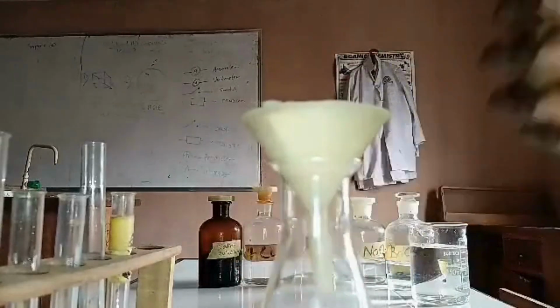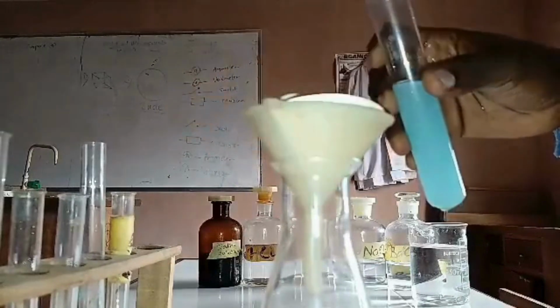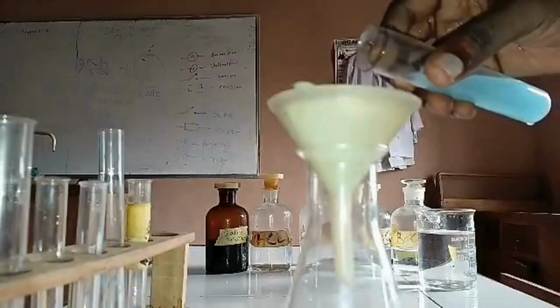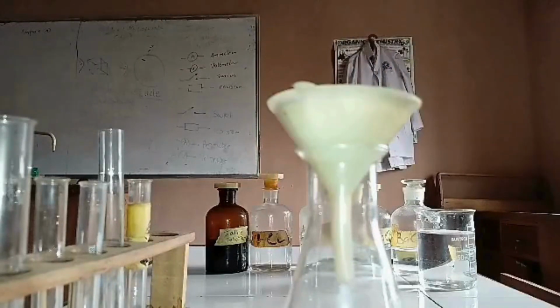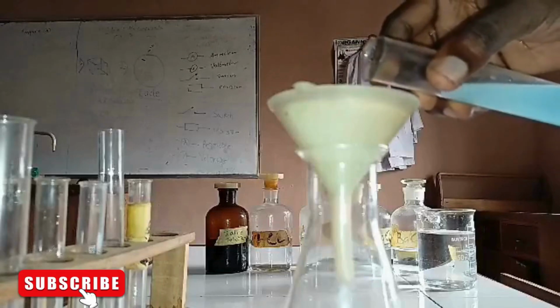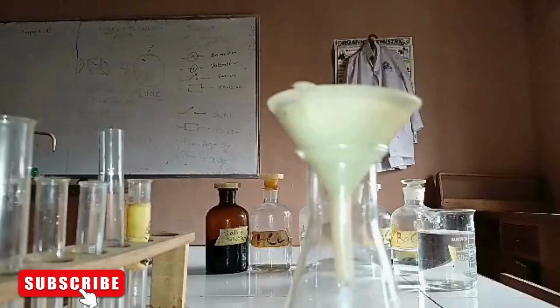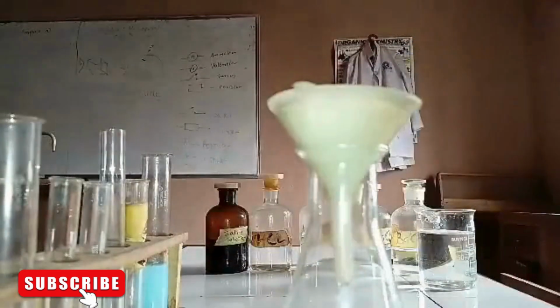and the solution will be filtered. So this is the process of filtering the resulting solution, which will lead to the formation of a white residue and a pale blue filtrate.